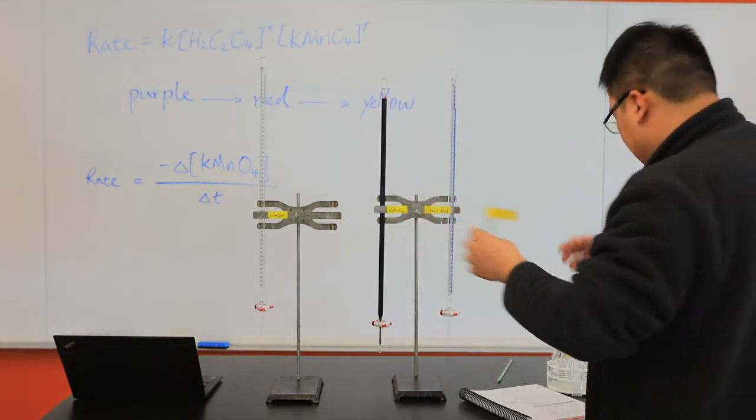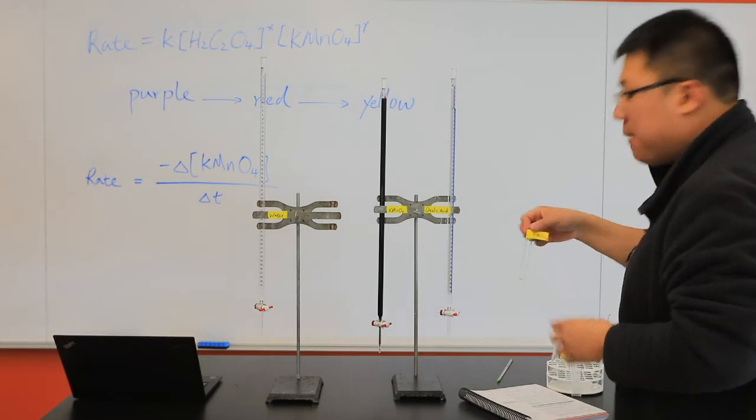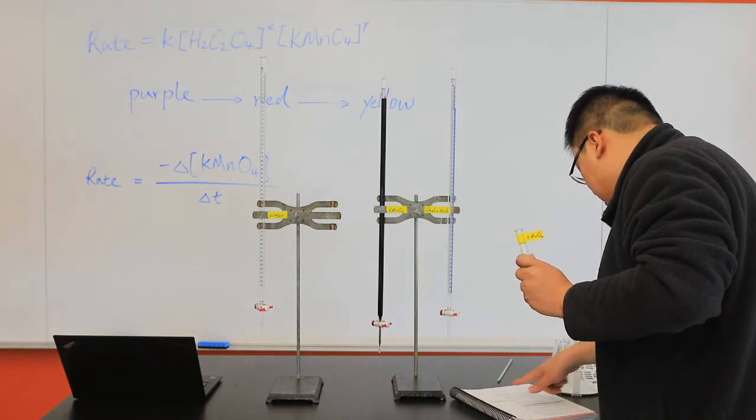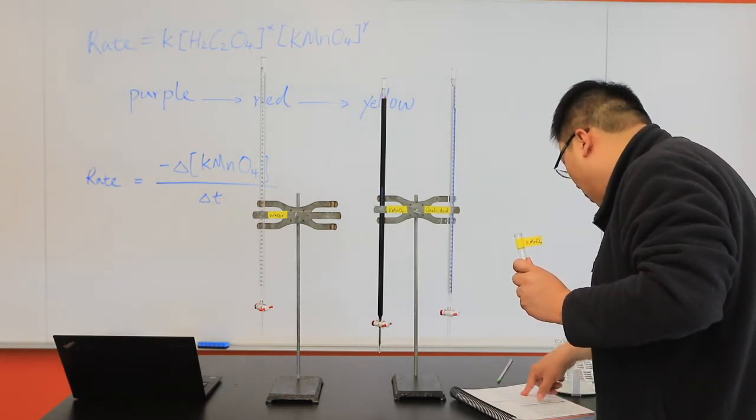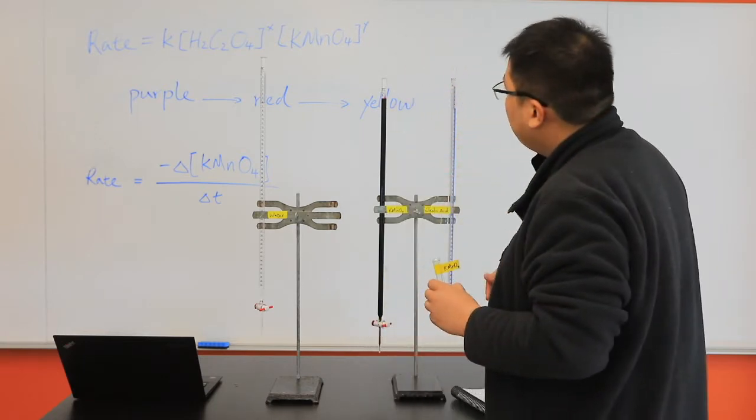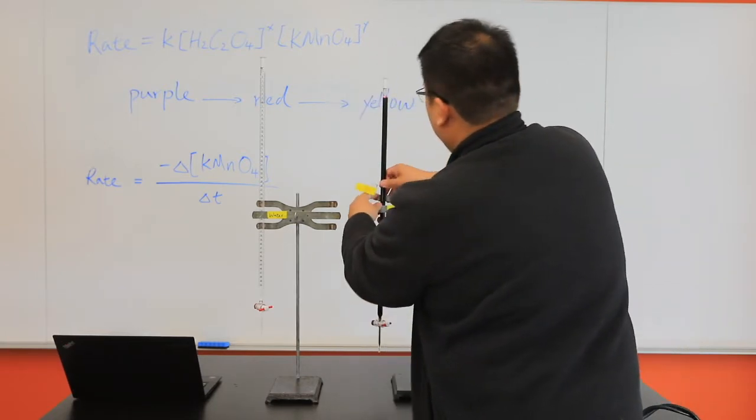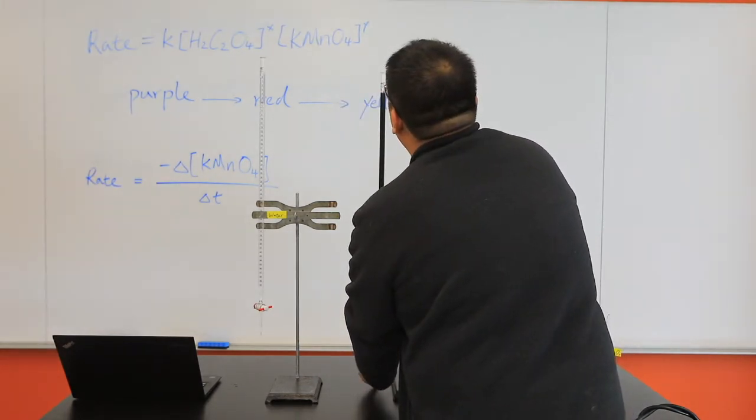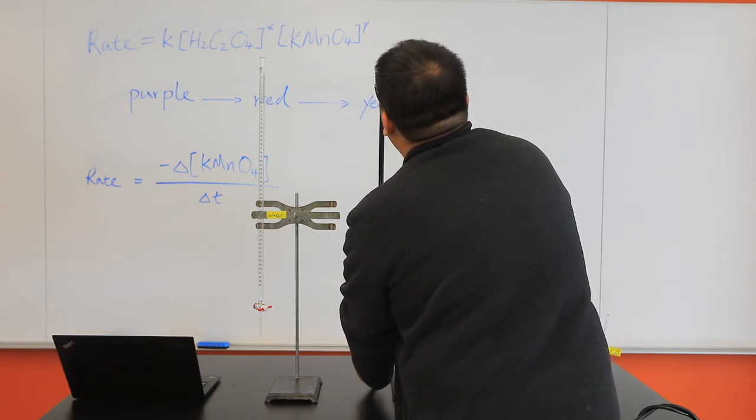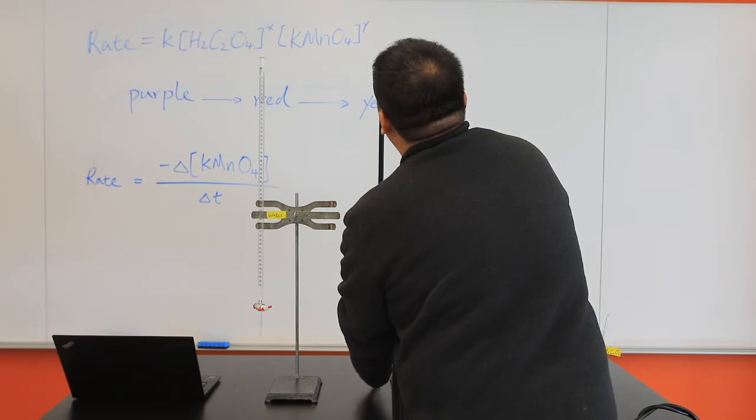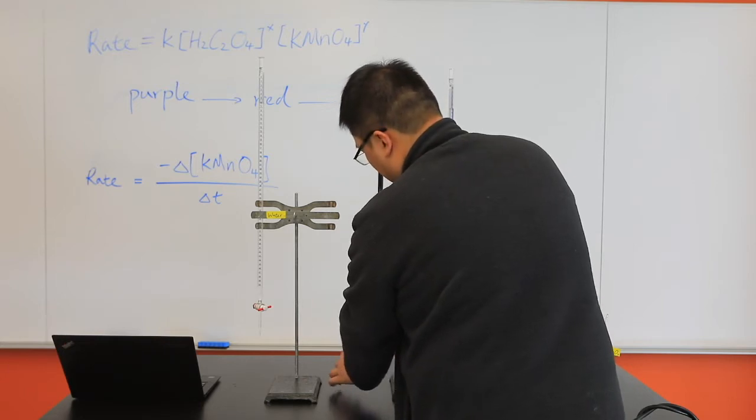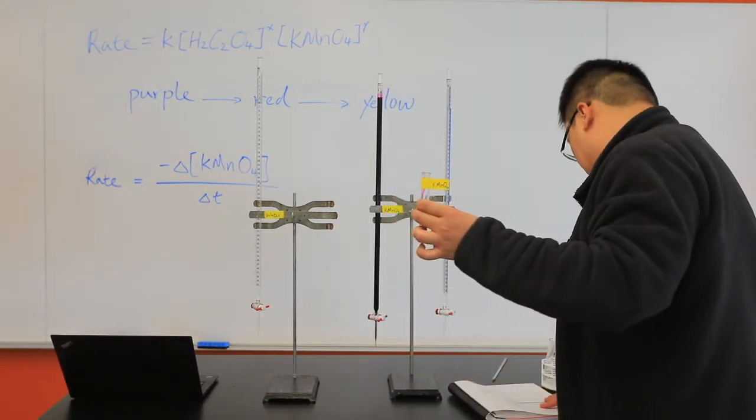I'm going to set this aside on my test tube rack. I'm going to get my second test tube for potassium permanganate. It's asking for 1 ml of it. The purple one is the potassium permanganate. Just need 1 ml. Since it's really dark, it's going to be a little hard for me to see the mark on the burette. Alright. So, this is 1 ml.